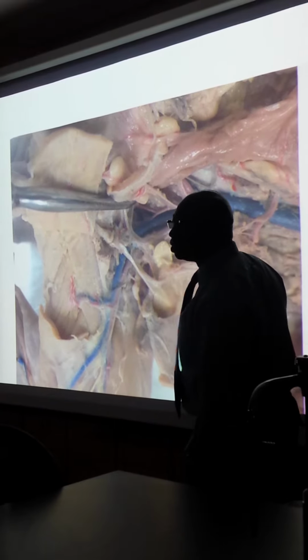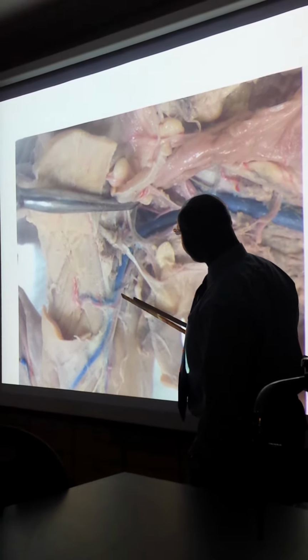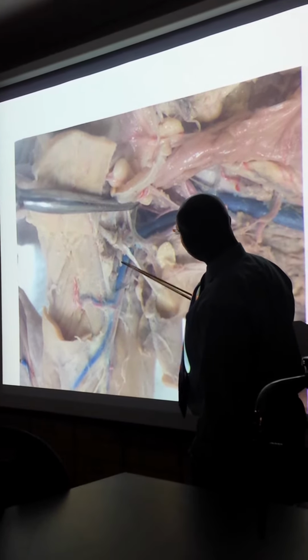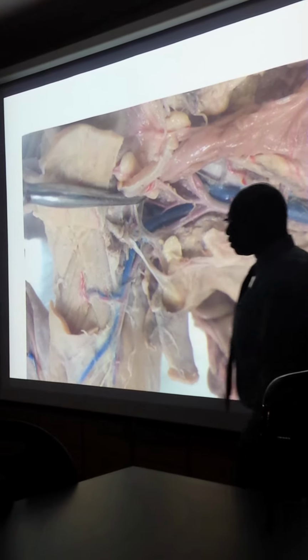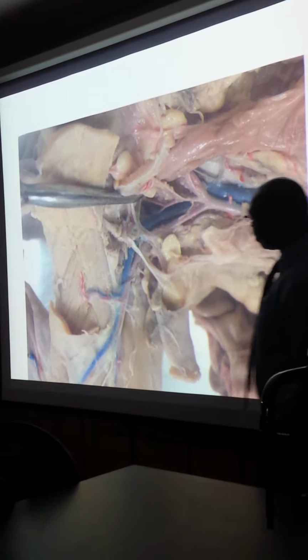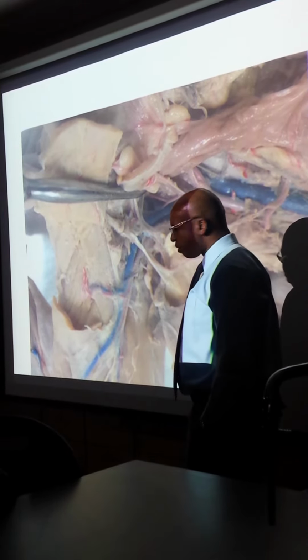You get the split into the deep femoral artery and vein, the one supplying the deeper muscles of the thigh. Correct. All right, and then it proceeds as the femoral artery and vein. You see this femoral artery and vein. This split here is the proximal caudofemoral artery and vein. I don't know if that's on the list.